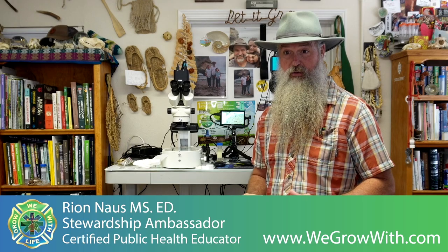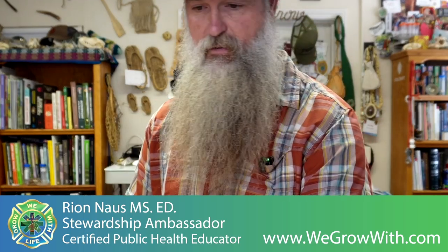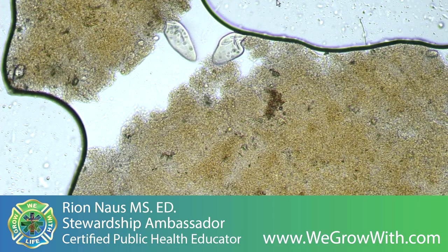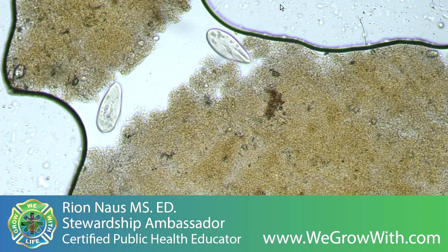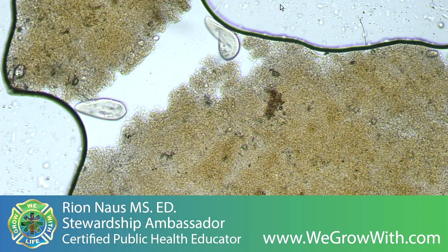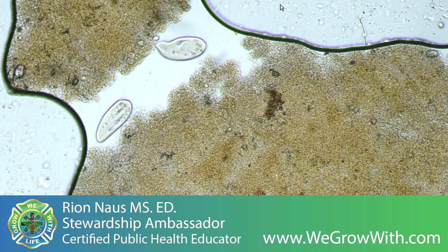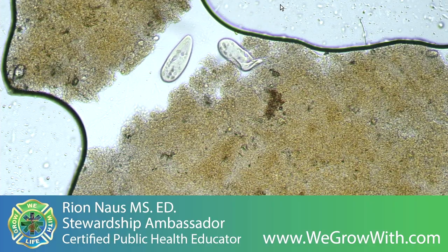Really great sample, and I want to show you what's taking place here. We're going to go to the microscope. Ooh, there we go. And get that out of the way. You can see they're trapped. Oh no! They are poking and probing every little spot. Oh man, almost.